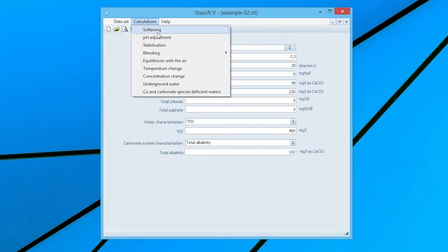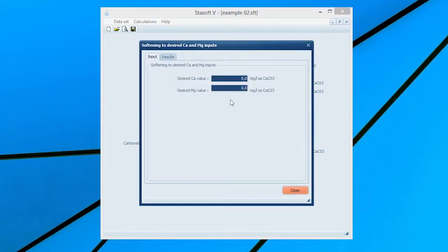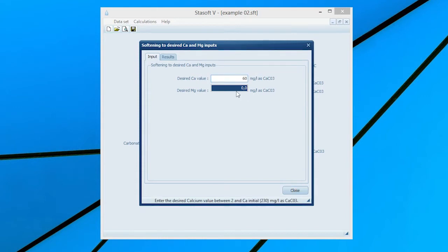Close the window and select Softening and Softening to desired calcium and magnesium values from the Calculations menu. This will bring up the Softening to desired calcium and magnesium inputs window onto the screen. Enter the specified calcium concentration of 60 mg as calcium carbonate by typing 60 into the desired calcium value input box.